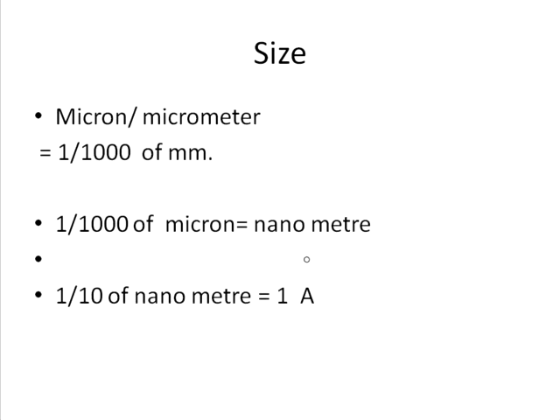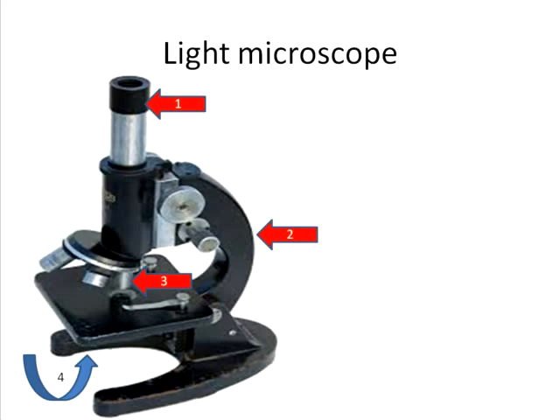So you can say that since bacteria measure so small, we need to give them a good magnification to be made visible to the naked eye. For this purpose, we use microscopes. What you see here is a light microscope, a simple one. It's just an optical microscope. There are many types of microscopes. The basic principle is magnification.